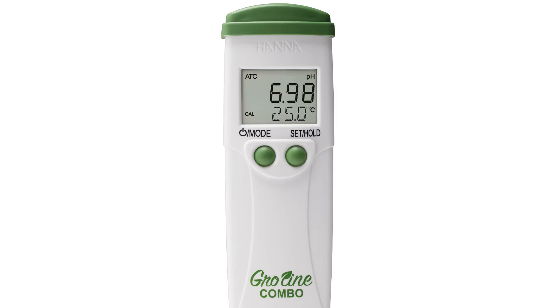Once all your settings have been set to your preference, the tester is now ready to be calibrated. Calibration is an important part of keeping your tester operating at its best — we recommend calibrating before each use. You can find everything for your tester at hannainst.com/HI98131.